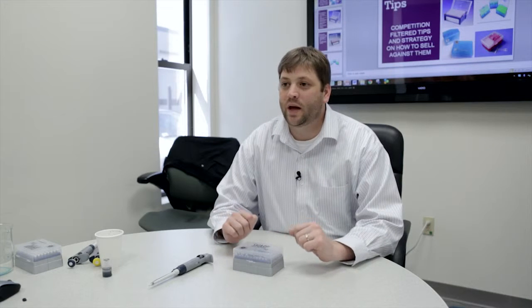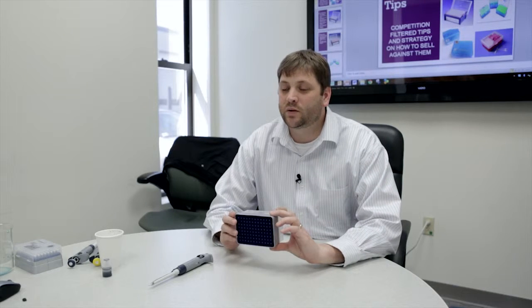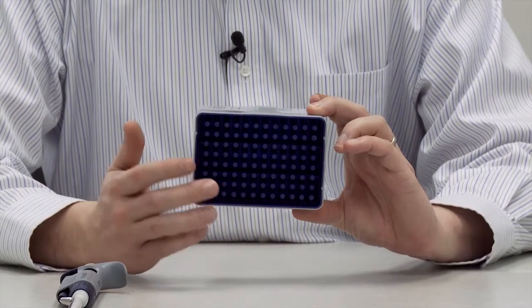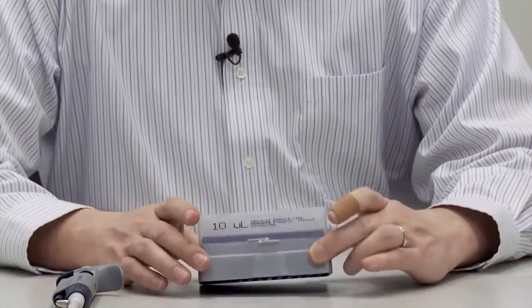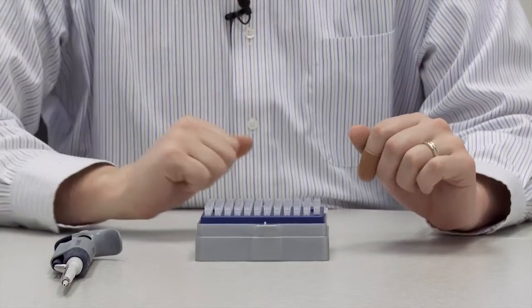First of all, you'll notice our base on our box is wider than it is at the top, built like a column, so it is sturdy. It does not flip. The next thing is we individually compartmentalize all of our tips. No cross contaminations. If the lid is open, you're not gonna have to worry about anything getting into your box.